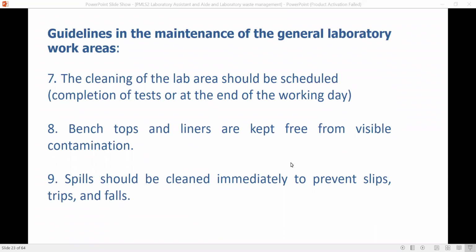So the cleaning of the lab area should be scheduled. Usually the cleaning is at the end of the working day. After you work, you clean the area before you go off duty. Then for the lab aid, the whole lab area is cleaned. So there is a schedule of cleaning. At the end of the working day, when the laboratory is not too busy, they schedule the cleaning.